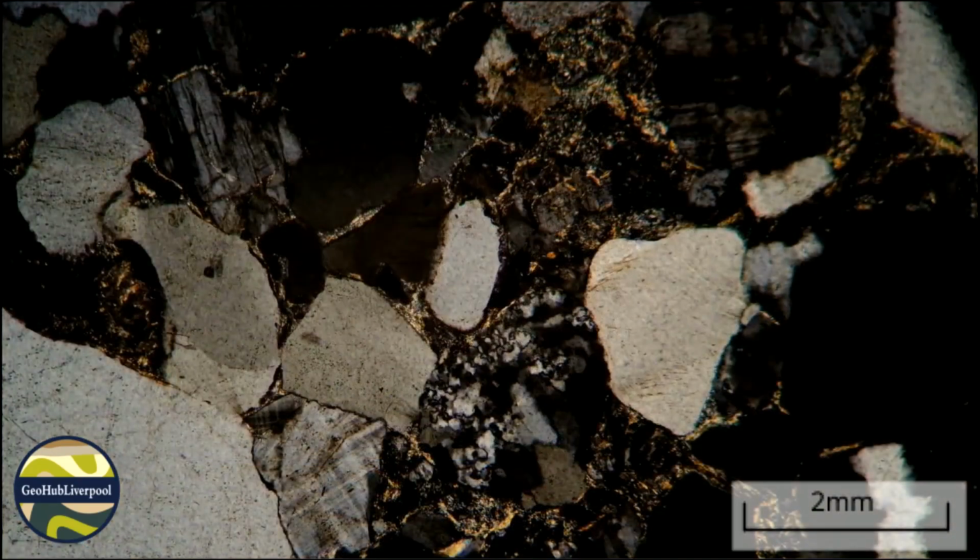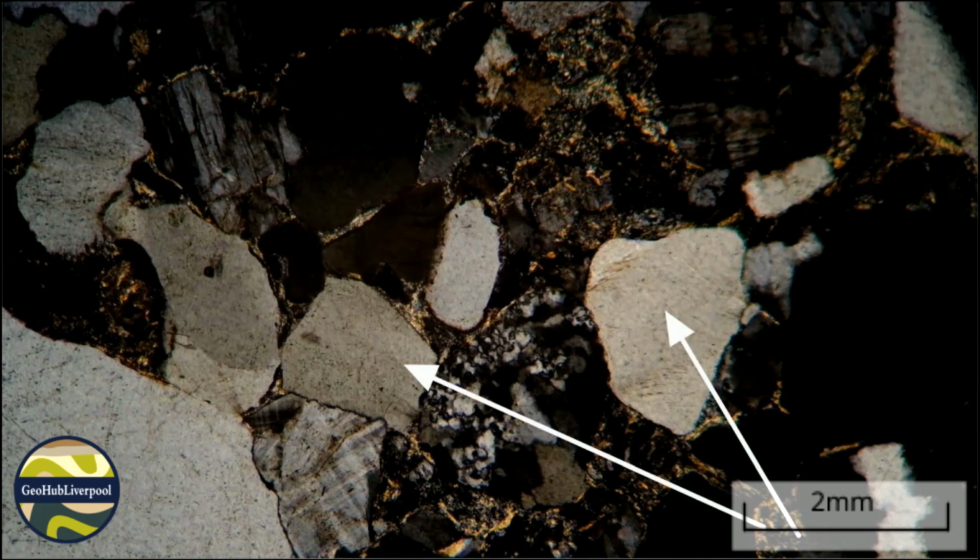On the cross polars, it's easier to see grain boundaries. Note that the grains neither show straight and regular outlines or crystal faces, nor have a banded appearance. The grains are largely sub-rounded to subangular in shape. This means the rock is a sedimentary rock. It's possible to identify the grain size, grain shape and mineral properties.